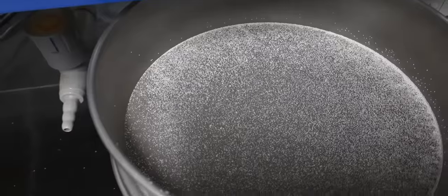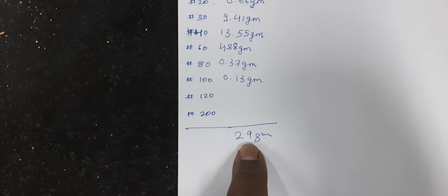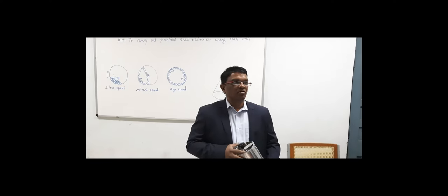You can total the values. A small quantity of powder will stick to the sieve as you can see. The exact quantity we took was 30 grams, but you cannot find that exact amount. So, sum the values and take that as the total quantity of powder. The total quantity comes to 29 grams, so 1 gram is wastage or material stuck to the sieves. The quantity of powder to be filled in the ball mill depends upon the volume of the ball mill.